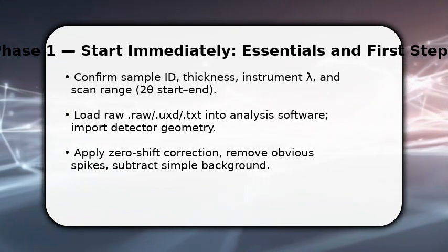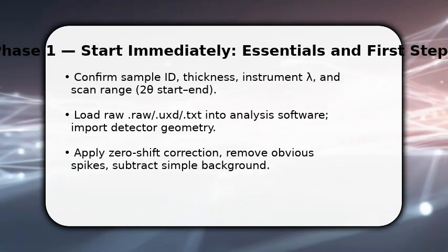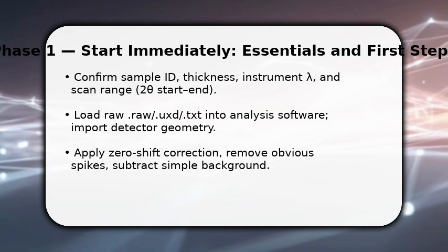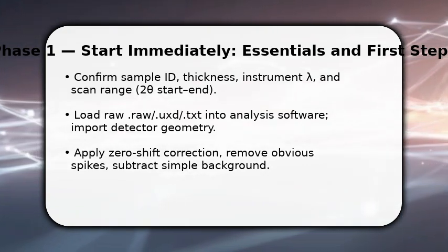Next, remove obvious spikes and subtract a basic background so peaks emerge clearly. This first pass readies the pattern for peak fitting and phase analysis, and it prevents bad initial fits later.